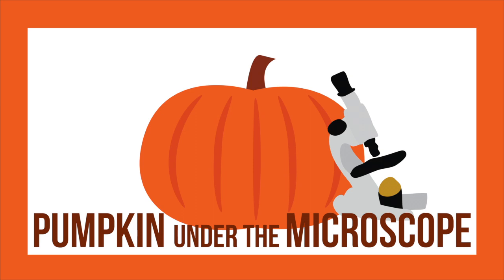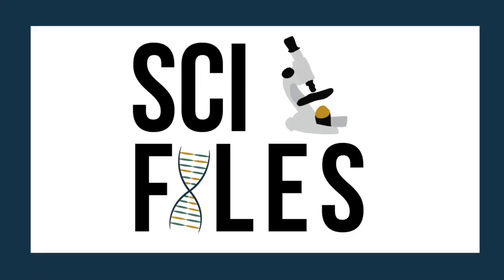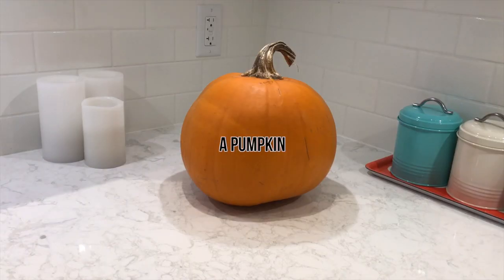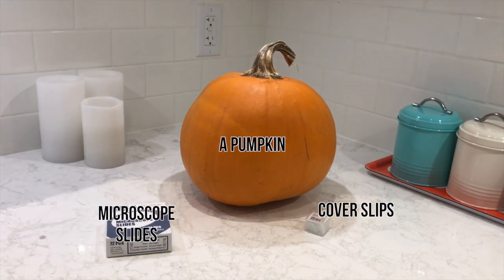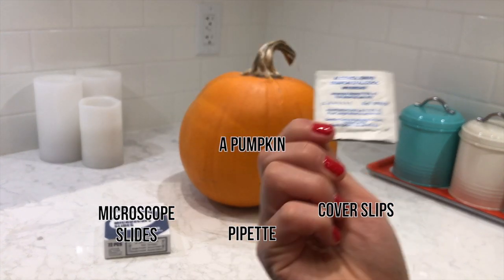Pumpkin under the microscope. You will need a pumpkin, cover slips, slides, a pipette, and an alcohol wipe.